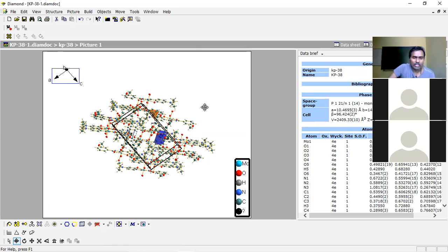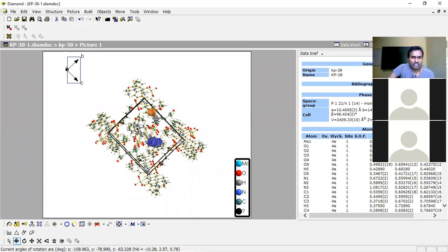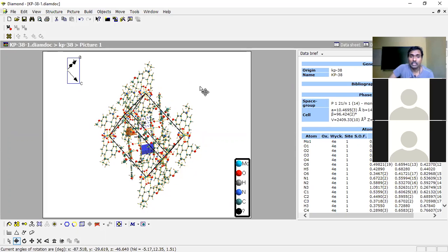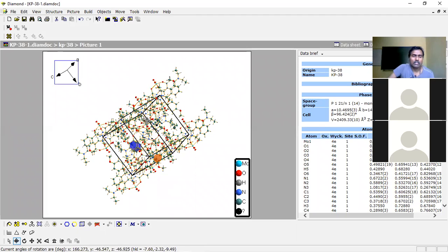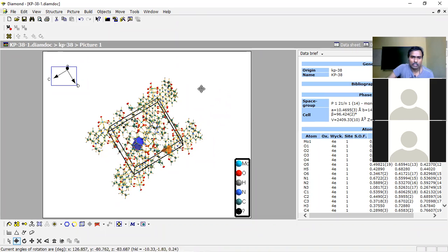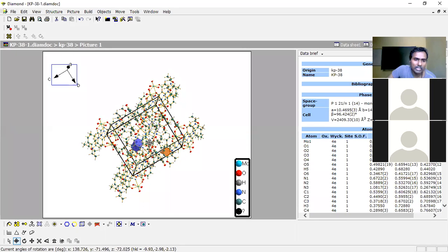After that we can draw it. Even here itself we can put the arrow, but that will not be visible. Usually we get it without arrows and draw using other software like Paint to draw the arrows only. We have to set in an exact position so that you can also show the axis. Otherwise, showing the axis is very difficult. Sometimes it will be surrounded by all the atoms. Therefore, drawing the arrows and putting the labeling of origin and A, B, C are very difficult. So carefully we have to rotate and see which one is more suitable.